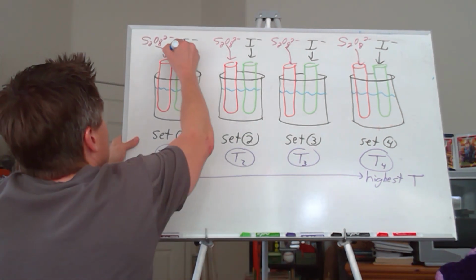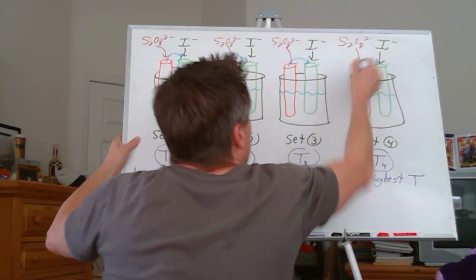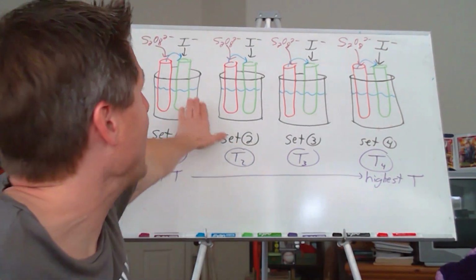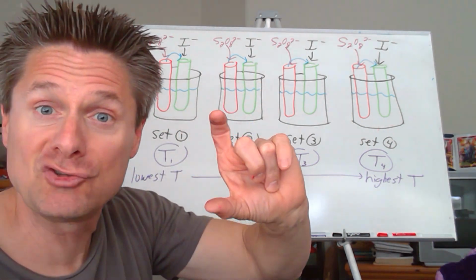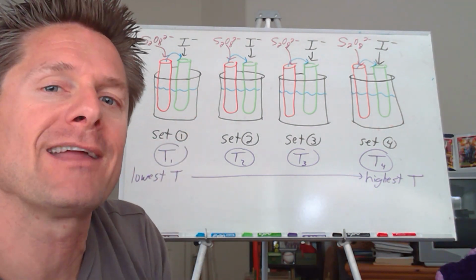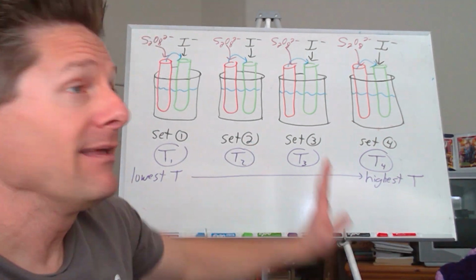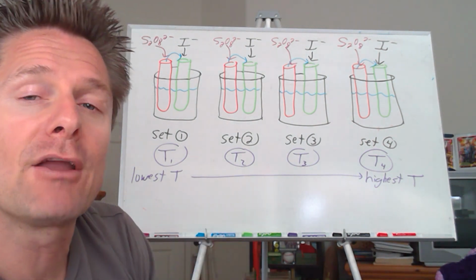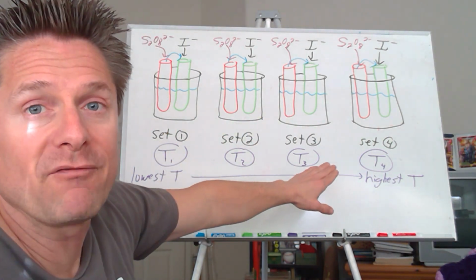So I'm going to take this test tube, pour it into there, pour that one into there, pour that one into there, pour that one into there, mix it up real good, shove them back in there. So we're going to run these reactions. The red ones will be empty. The green ones will have both solutions in there. The reaction commences. That will be T equals 0, T initial. And I'll show you a picture of the clock at that time. Then we sit there and wait until they turn blue. Boop! That's the final time. I'll take a picture of the clock at that time, and you can calculate the change in time based on that, right? And at the 4 different temperatures.